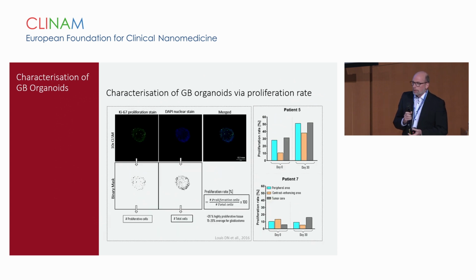We did a lot of characterization according to the Jacobs paper, but also together with the pathologists at the hospital, in order to have exactly the same endpoints analyzed as they would do with the primary tissue, to retrospectively have the best possible comparison strategy to understand what we produce as an organoid, and to define where the strengths of this model are and where the limitations are. And you see already here, as a glimpse, that from patient to patient we have high variability. This is not new to this audience, I guess.